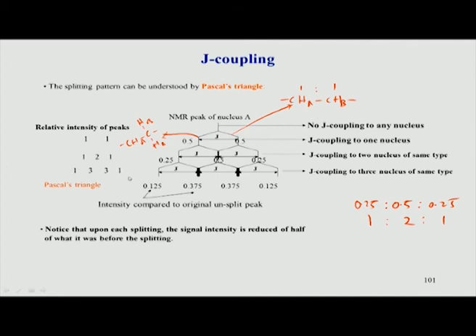So, you see in this manner one can keep on splitting this hydrogen because of any number of hydrogens around itself. If there is one more hydrogen, you can split it further. If you have one more hydrogen here, you can split it further. What one has to do is start initially with no splitting, then split because of the hydrogen into 2 peaks, half and half, because of some J value, then further split because of the next J, and you can keep on doing this as long as you have J values.